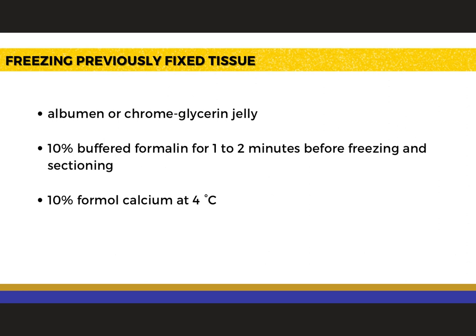Special fixatives such as 10% formol calcium at 4 degrees Celsius may be used in histochemistry and for lipid demonstration. So, tissues that have been fixed or stored in alcohol should be washed in water for 12 to 24 hours before sectioning since alcohol inhibits freezing.